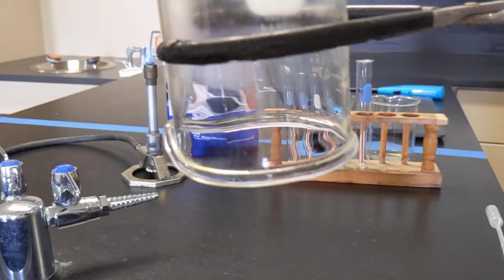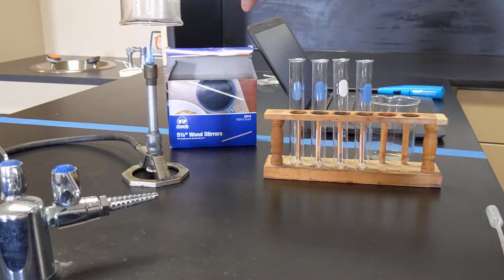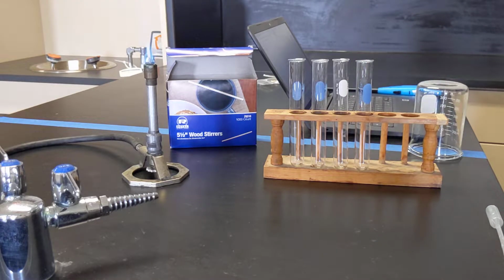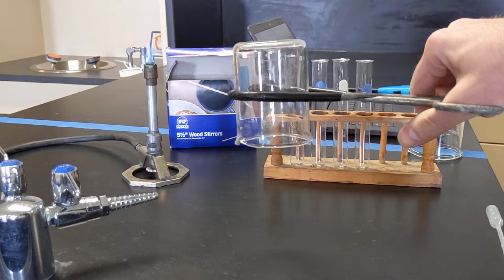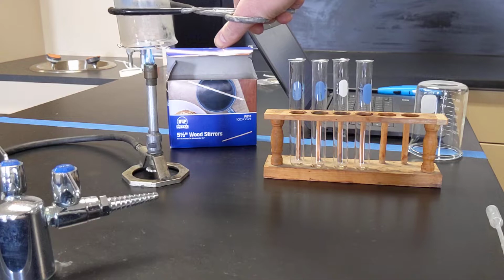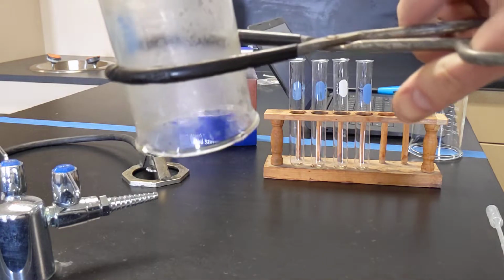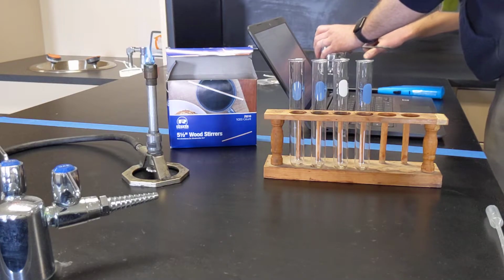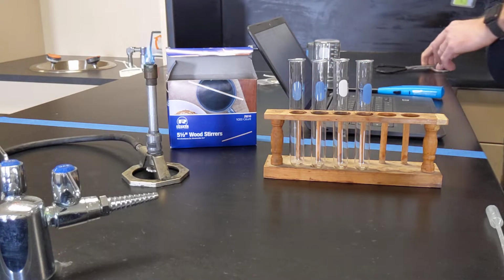Happened again. You can kind of see it a little bit, maybe. And then when this gets too hot, it doesn't do that anymore. Try it one more time with a different beaker. This is a different beaker that's still at room temperature. Put it over there. That one maybe was a little bit more obvious. Hope so. Okay, that's all of reaction one. I'm going to keep the Bunsen burner lit because I do need fire later for the gas test.